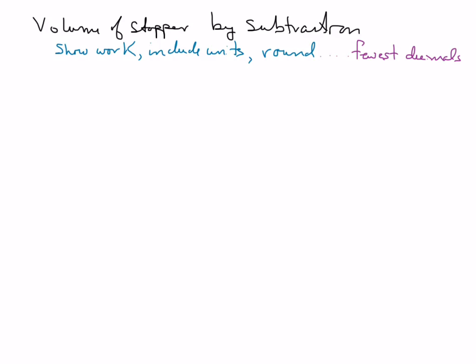I got bubbles in there. I don't want those bubbles. But again, you need to estimate between gradations. If this is the sort of graduated cylinder you use, let me think. It looks to me like every division is 1 milliliter. So if that's the case, you can estimate between, so that's the point X, like 1/10 of a milliliter.